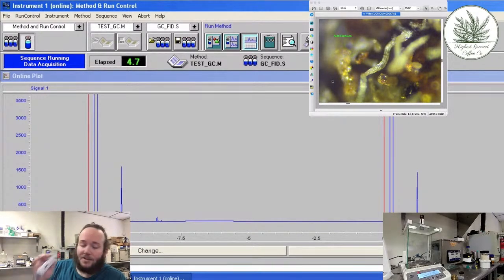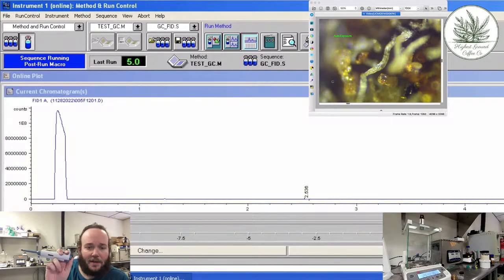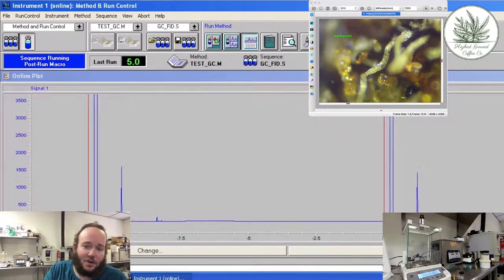So the low end on this thing is 10 microliters. Yesterday, when I was trying to extract 10 microliters from the standard, it felt to me like I couldn't only hit this first action, because as the amount gets smaller, the travel on this thing also gets a lot smaller. So it felt like I couldn't fully extract just 10 microliters. I felt like I was getting into that second one. So I have a suspicion that those dilutions may not have been correct.